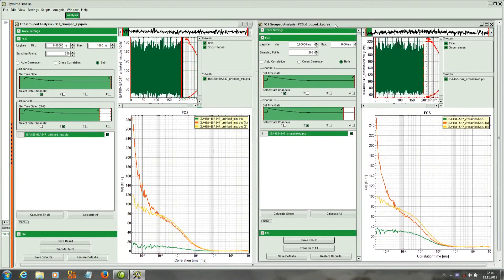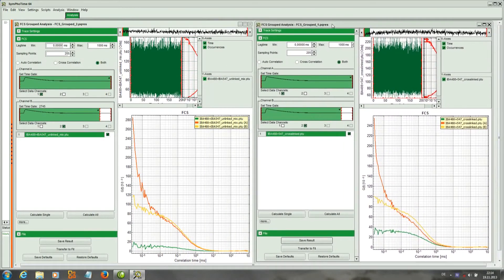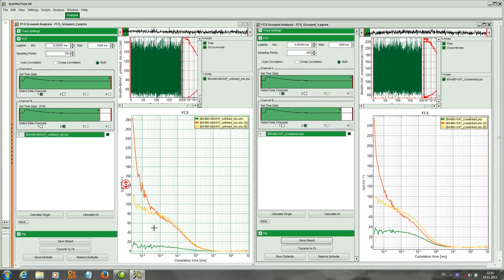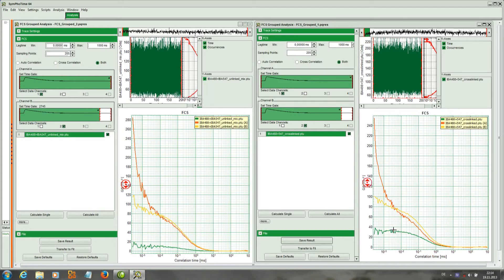Now you can see what is the use of fluorescence cross-correlation. Here in the unlinked sample, the cross-correlation amplitude is much lower than here in the sample where they both are together.